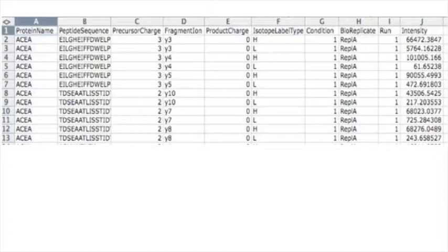So if you have a protein which has 10 features, in the first run you will have 10 lines, because each feature in the run will have a separate peak, and each peak will be described with all of these things. So if you have 10 features in a run, and you have 3 runs, you have 30 lines. They just become concatenated. And this is a very good format because it represents many different experiment types in a very consistent way. For example, the Skyline external tool exports a report exactly in this format. We work very closely with Skyline to generate the MSstats report exactly as is.